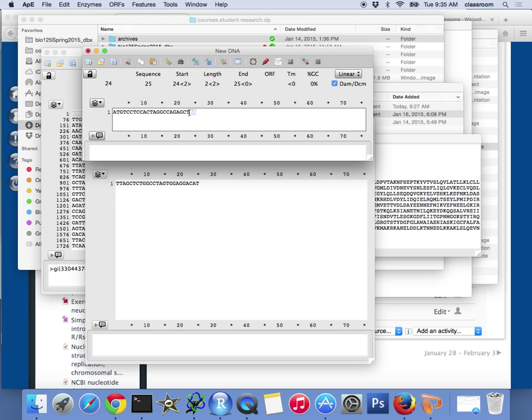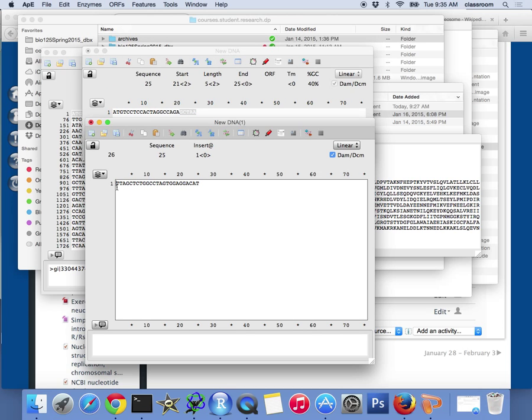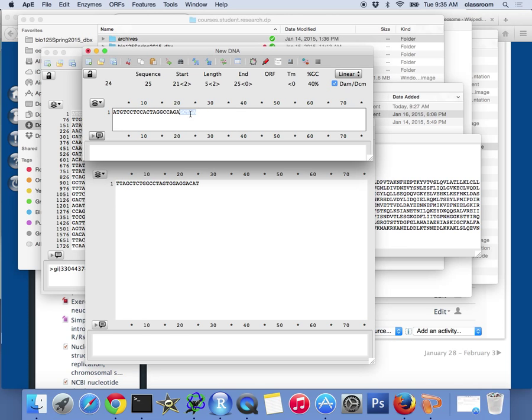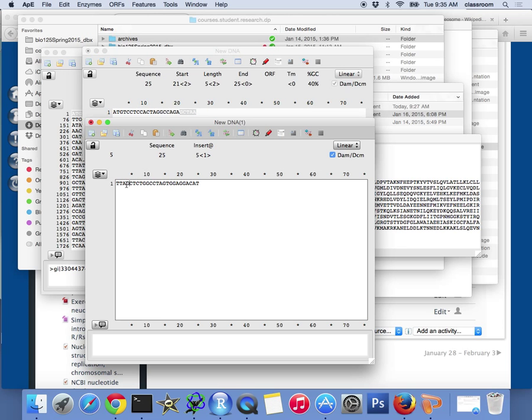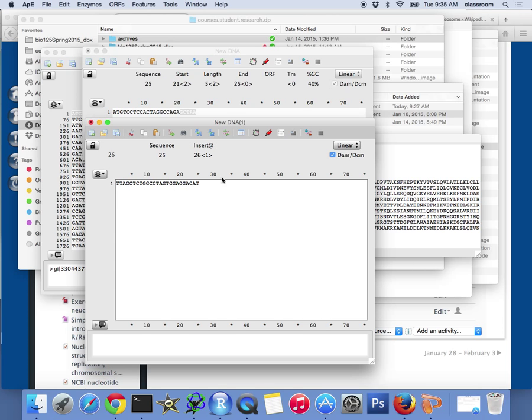So this should be AA, that should be TT, and then it has to be CGC. TT, CGC, TT. Oh sorry, TTAGC, TTAGC. So at least the first five nucleotides are correct.